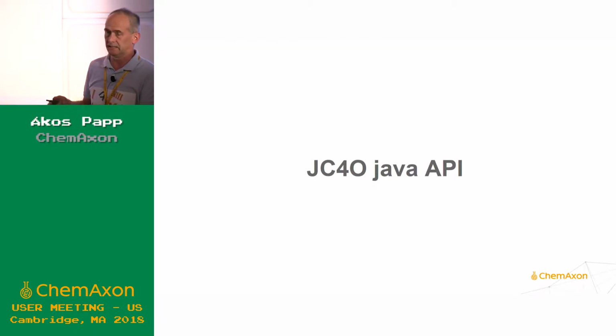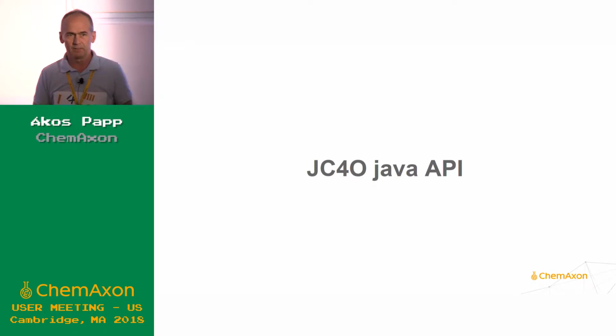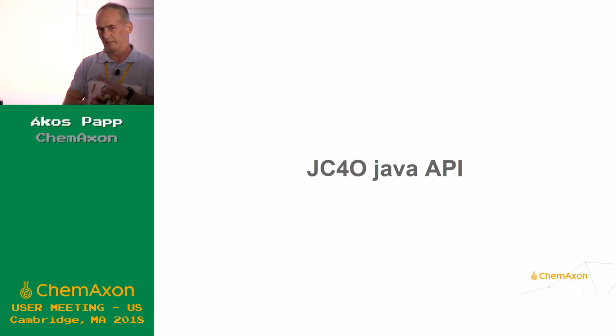And it results in documents which include JChem for Office structure objects that are editable. So the whole reason why I'm here at the end of this UGM is that with this tool, whatever integration you have, you can create, for example, PowerPoint reports, including your molecules, tables, and data and everything.